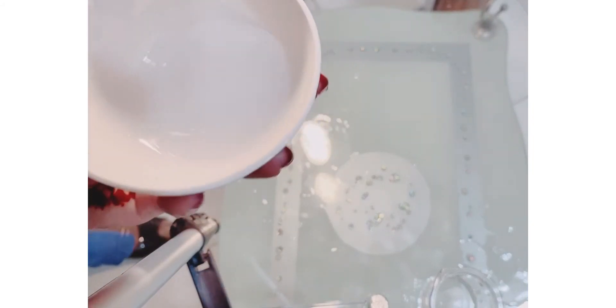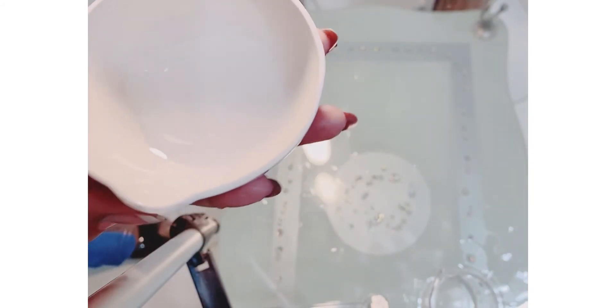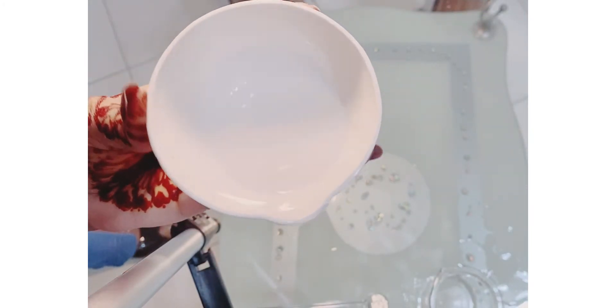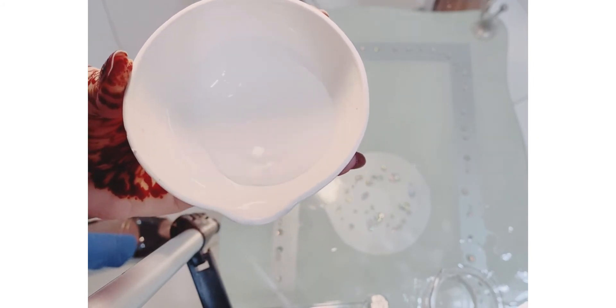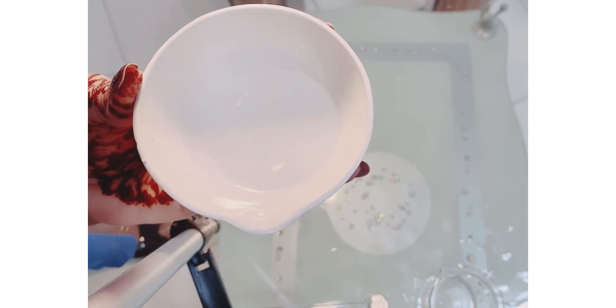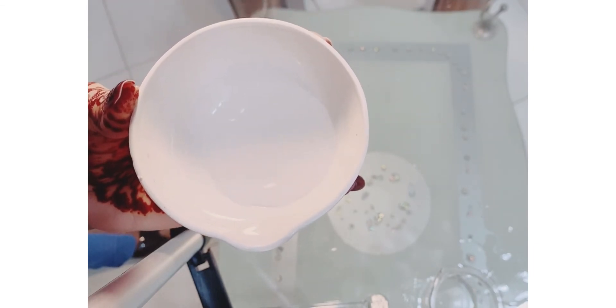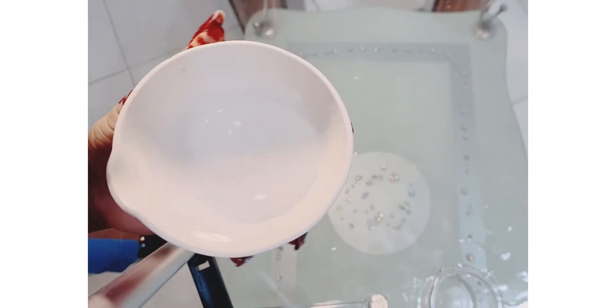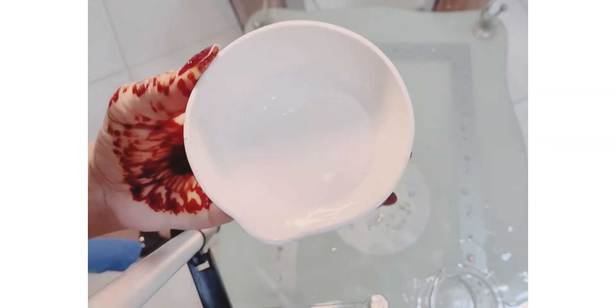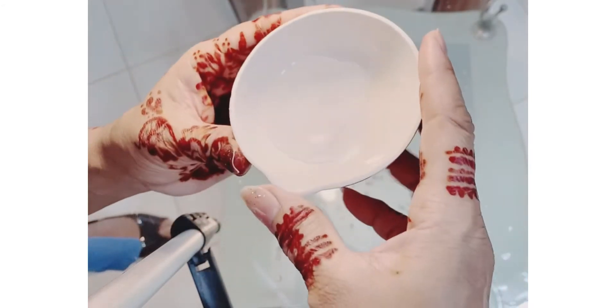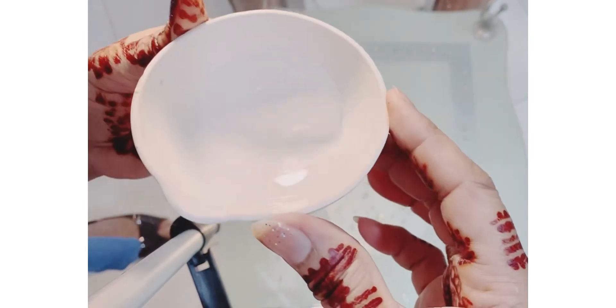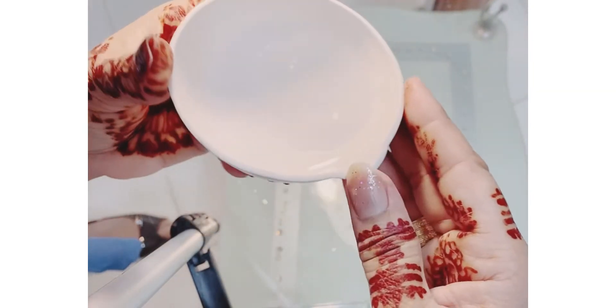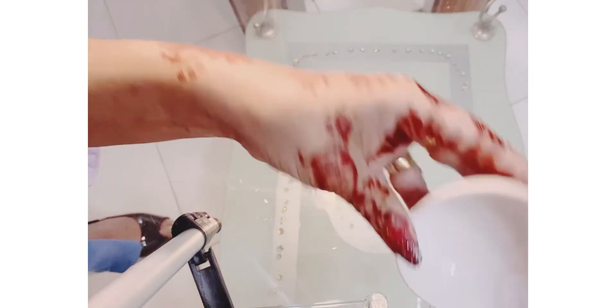So this is a very useful part of our lab. As mostly in organic chemistry we need to reduce a lot of solvents during the preparation of any organic compound. If you are not getting the crystals or precipitates you are looking for, you will simply reduce the volume of the solvent. And in that sense this container is used, or this china dish can be used. It can be used to simply reduce the volume. And as you reduce the volume in a very short period of time, you will be able to reduce all the volume and what you will be left with - you will be left with a lot of precipitates in the end.